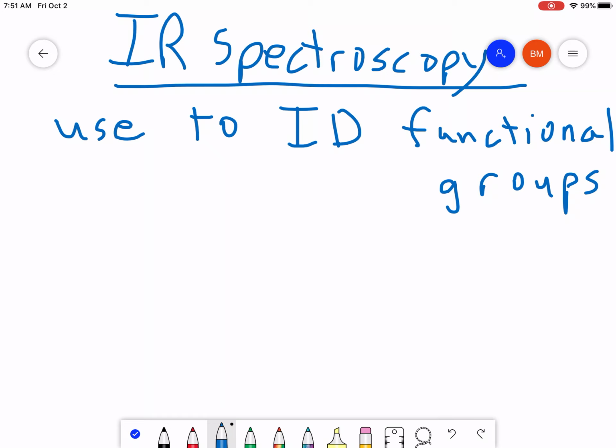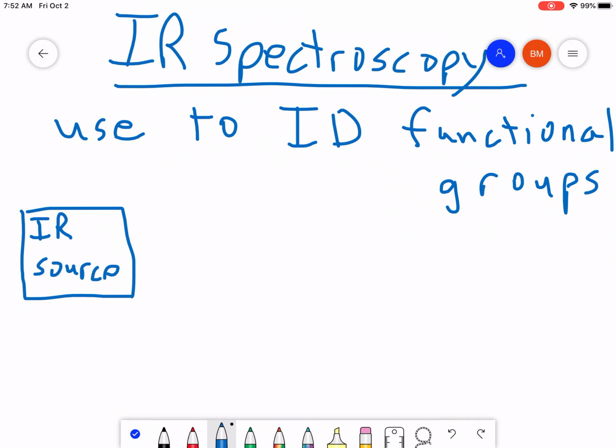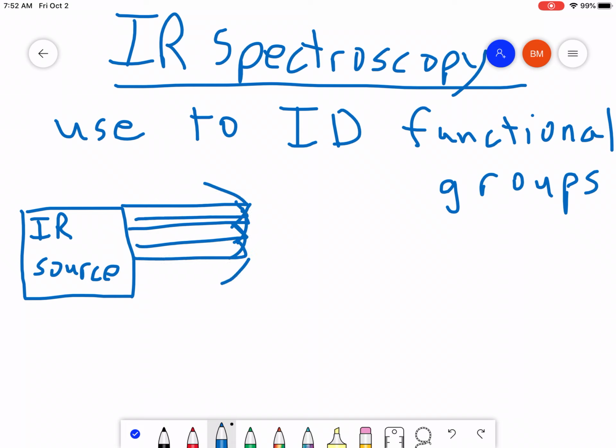All right, so in a nutshell, if you look at a schematic of all the different pieces and parts of an IR spectrometer, it's very, very complex. Here is the nutshell version for you. This is basically the net effect. At the beginning, you have something that serves as a source of infrared radiation, an IR lamp, basically. This shoots out IR radiation, and you see I'm drawing a whole bunch of arrows here. This is to signify that it's doing it within a range of different frequencies.